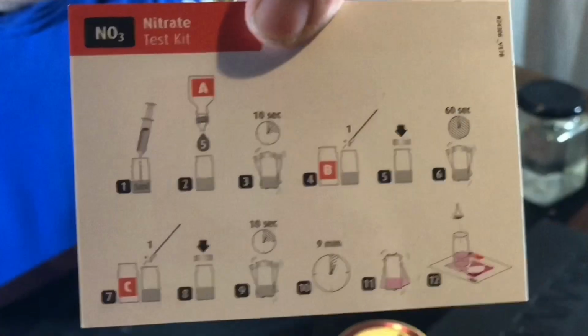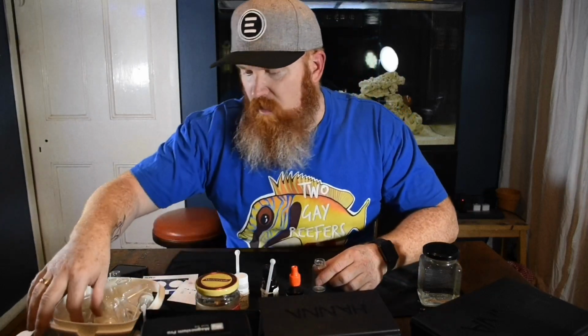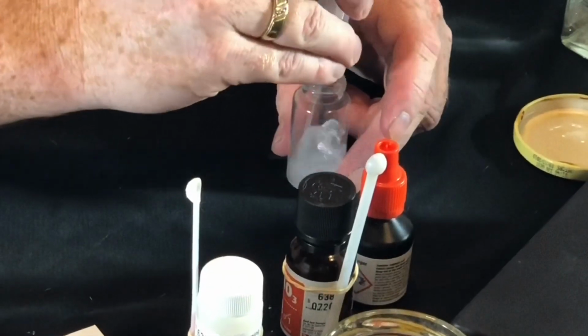So I've got my little nitrate test kit card here. Alright, I need my C, B, and A. I've got myself one little Red Sea vial and a 5ml syringe. Make sure you get an accurate amount of salt water, put it into the vial. First thing you want to do is put 5 drops of the reagent A.